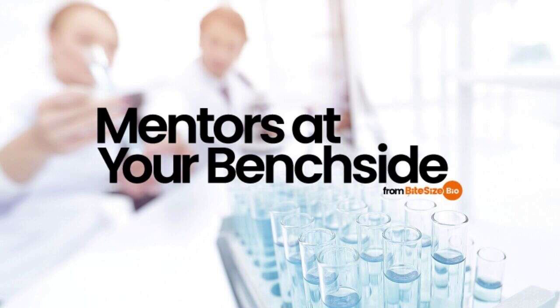I thought it would be good to mention that many plasmid kit manufacturers have recognised that the pelleting step is problematic for some users, so have developed kits that desalt the DNA using precipitators or silica disc filters. These are a fast alternative to centrifugation. However, you still need good isopropanol for these to work, so always use fresh.